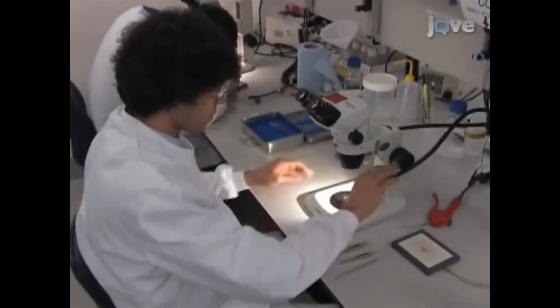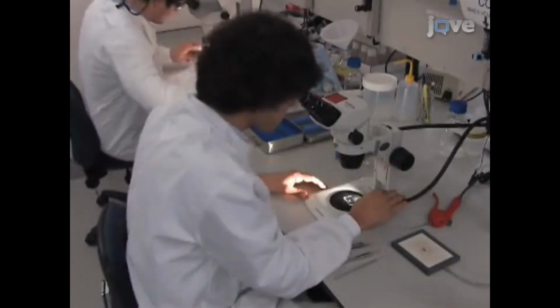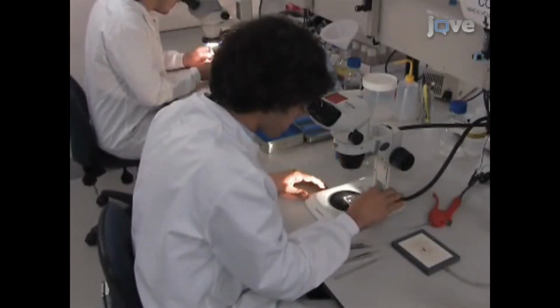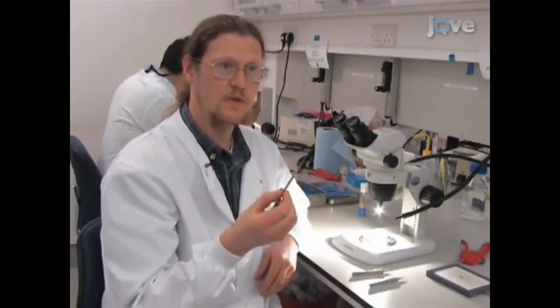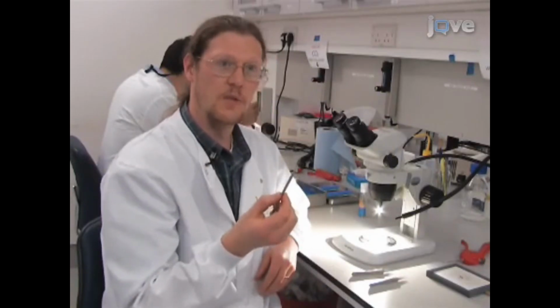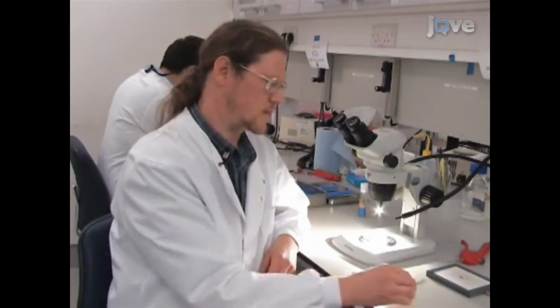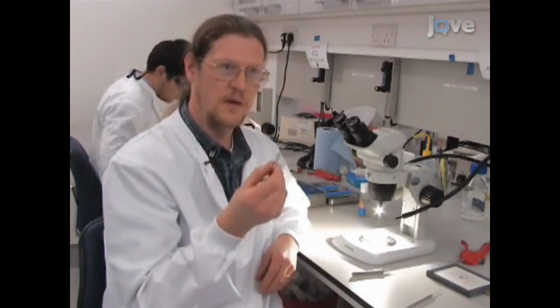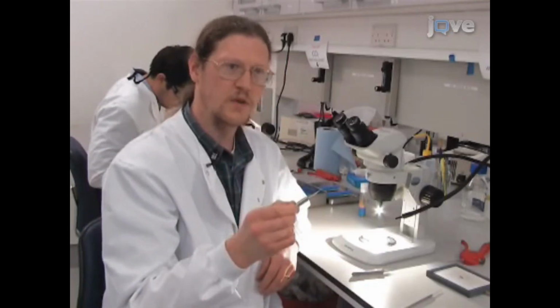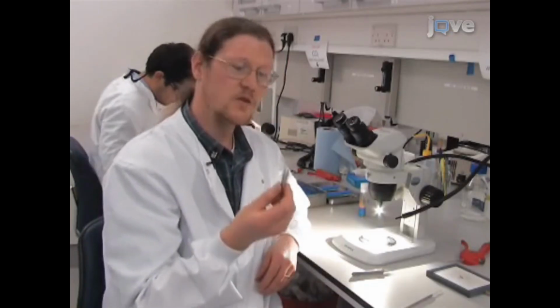Prior to isolating the ovarioles, adjust the light source on the microscope so that the illumination strikes the slide at a shallow angle and creates contrasting shadows on the tissues. When dissecting the flies, it's very important to use the right tools. The pointer we use is not too sharp, so it doesn't damage the tissue, but fairly blunt, so we can capture the oocytes. The tweezers we use, again, are not too sharp so they don't damage the tissues, but just fine enough so we can manipulate things without bending the tool. It's also very important to have clean tools, so we clean them regularly throughout the procedure.